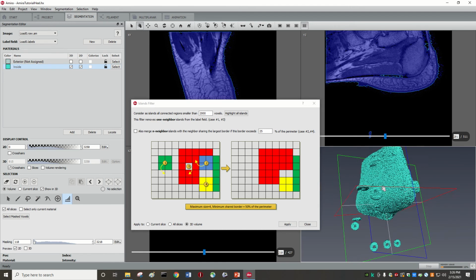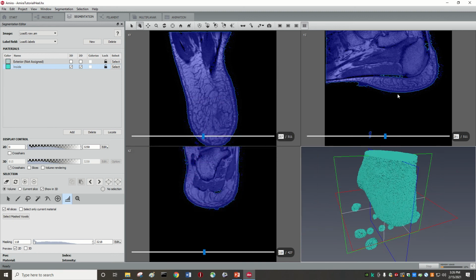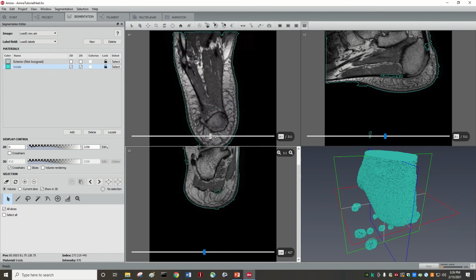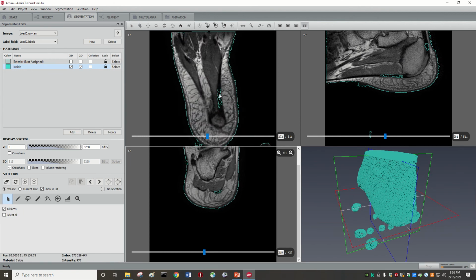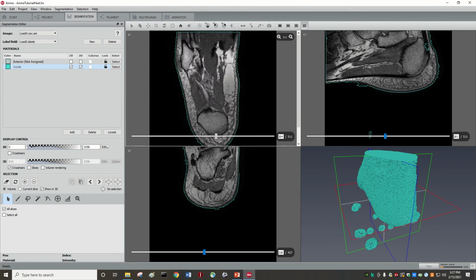Okay, it seems, I don't know if these are even bigger islands, but there is another trick to solve this. So we go here, we press this arrow, and we just have to select the holes that we have inside. So for example, this one, okay? And then this is inside, so we have to select inside like this, and then we add it. So we can either press plus or A. Okay, A doesn't work. I don't know why, but okay, let's just give it like this.